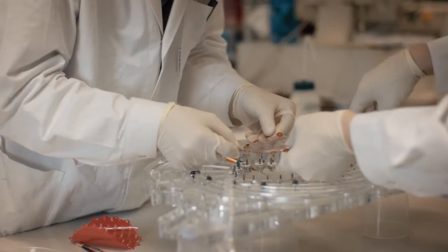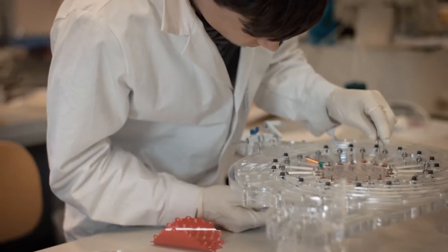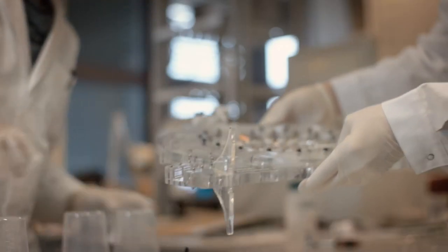So we thought, how can we make a device like that? It should be easy to manufacture, cost-efficient, using rapid prototype machinery.